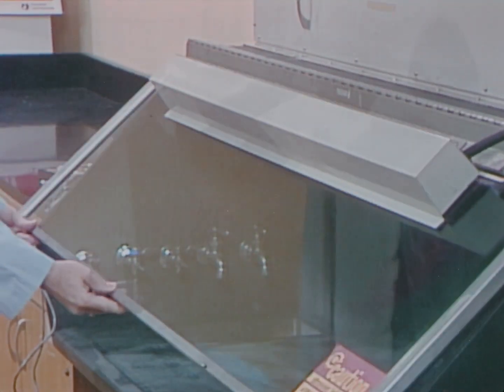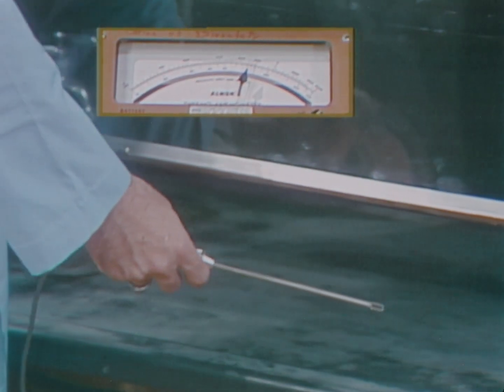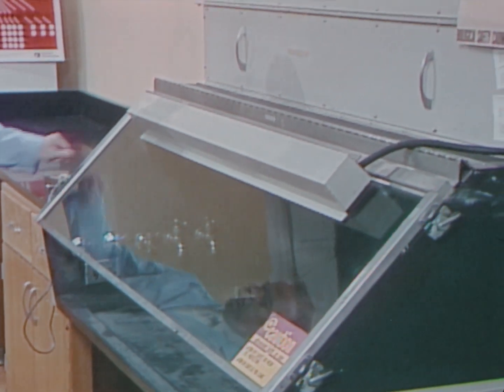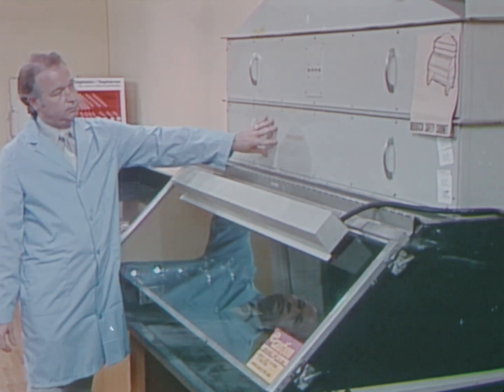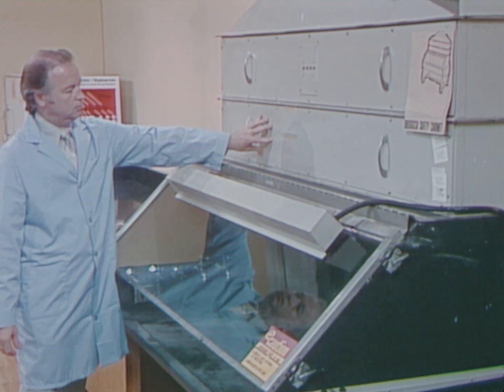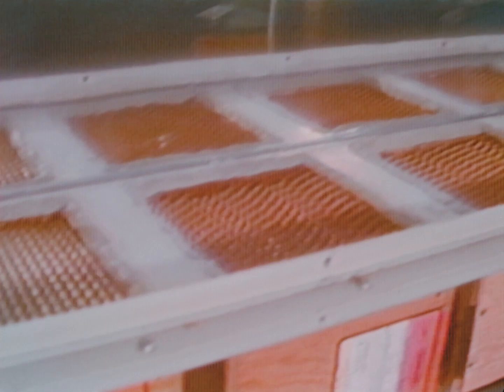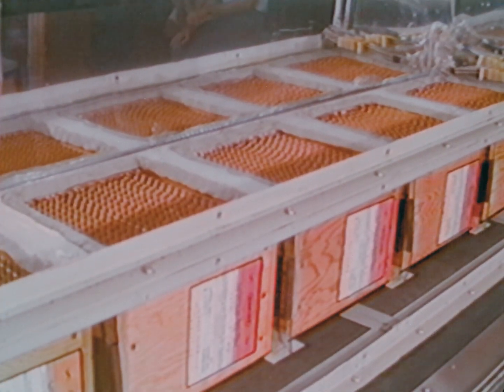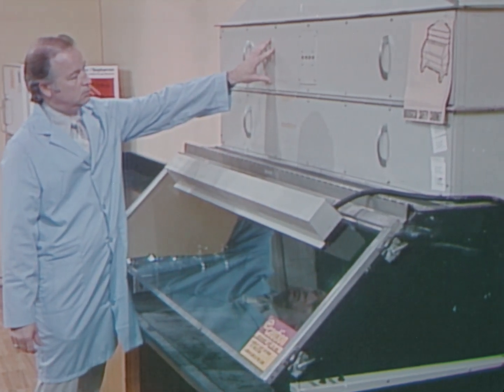The cabinet is equipped with an access opening through which most items may be placed in the working area. Larger items can be introduced by raising the hinged glass plate. Air is drawn through the front opening by a blower at a velocity of 75 linear feet per minute. The effluent air from the cabinet must be decontaminated to protect people downstream. In this model, high efficiency particulate air filters, called HEPA filters, are located above the work area. They are designed to retain 99.99% of particles 3 tenths of a micron in diameter. As an additional safeguard, an ultraviolet light is mounted above the HEPA filter.